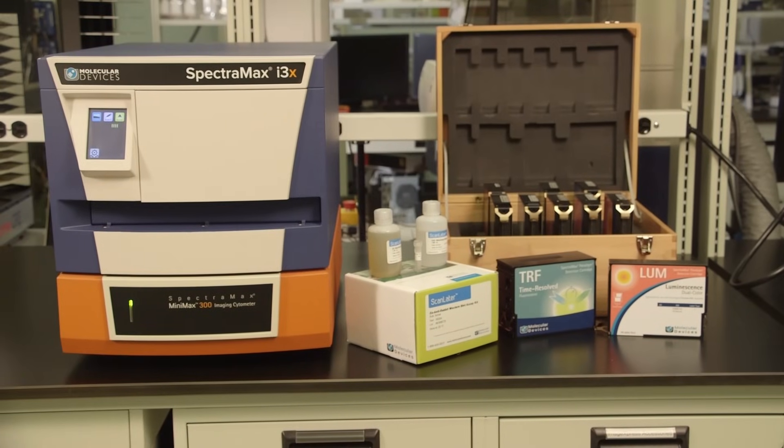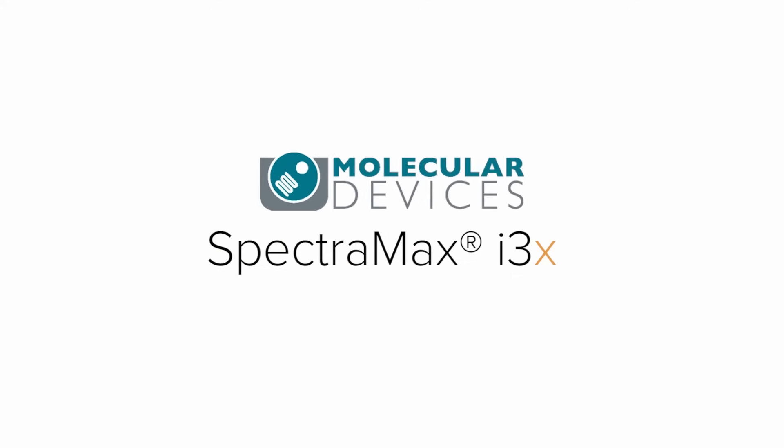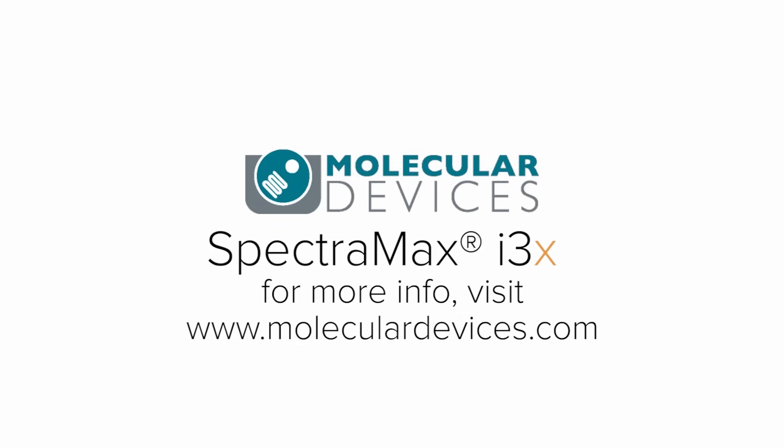Why settle for less when you can have the best? Discover the SpectraMax i3x multi-mode detection platform today. For more information, visit our website or contact our sales team today.